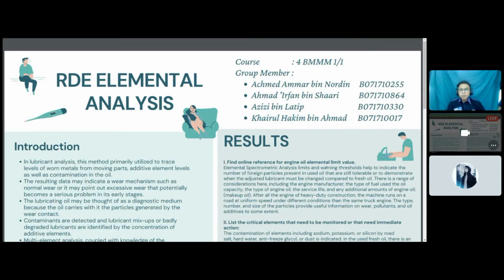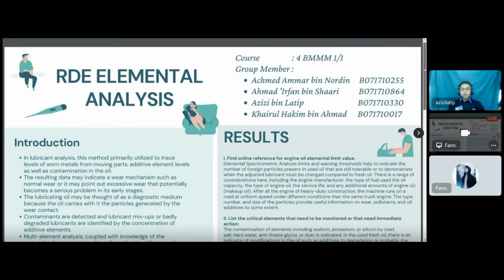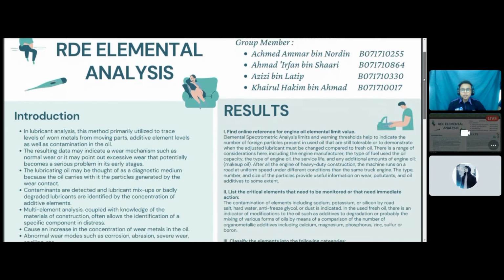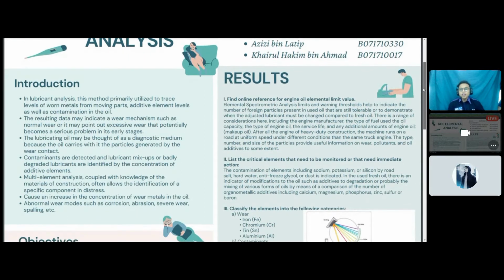The RDE elemental analysis in lab 3 is for analyzing lubricants. This method is primarily utilized to trace the level of worn metal from moving parts, additive element levels, as well as contaminants in the oil. So the resulting data may indicate a wear mechanism.